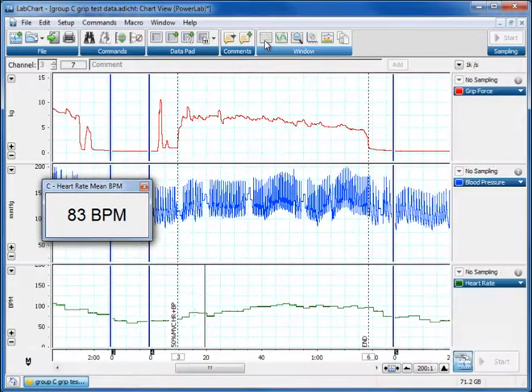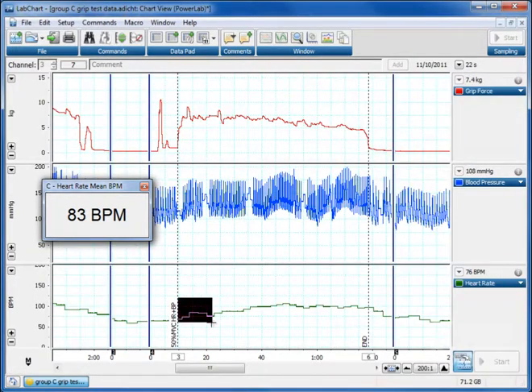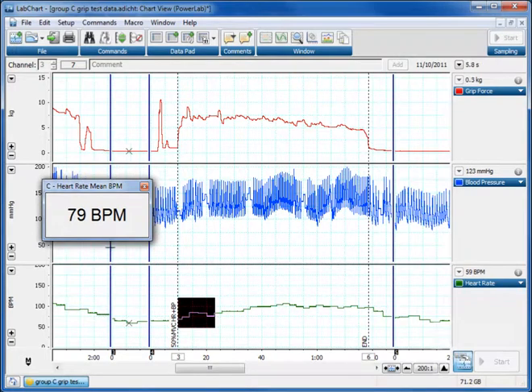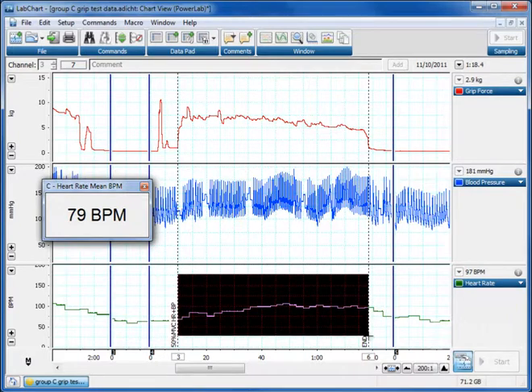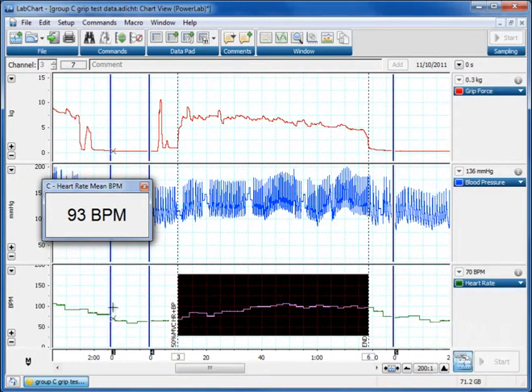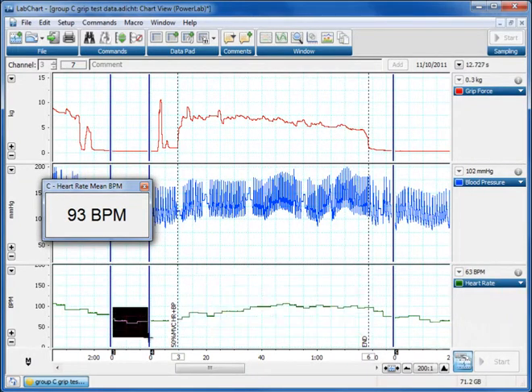So we can go back to our chart view and we can select areas of our chart and it gives us now a mean heart rate over the area we've selected. So for instance what was the mean heart rate during all of this experiment? 93 compared to a baseline period prior to the experiment? 63.